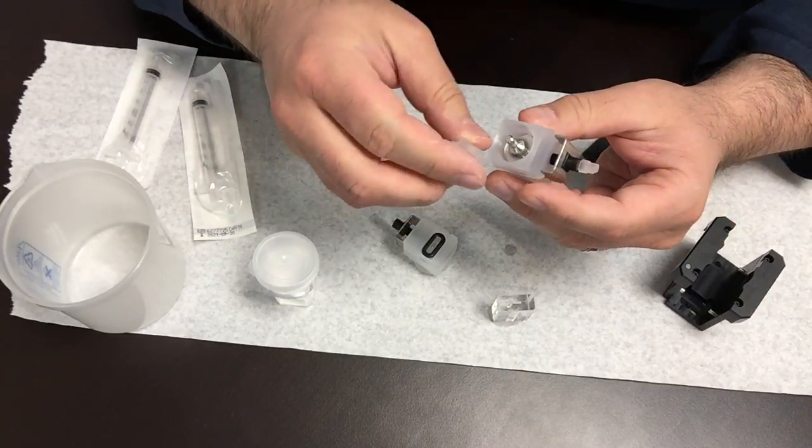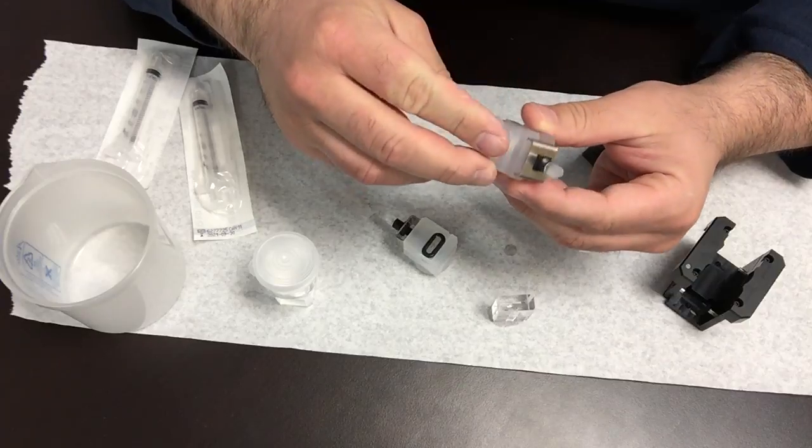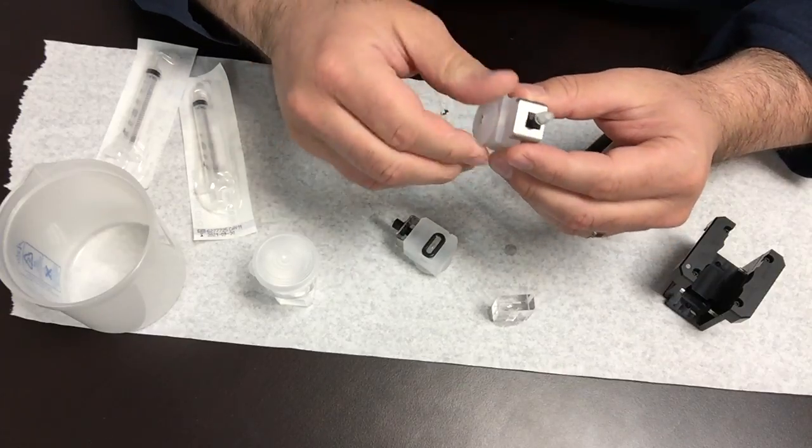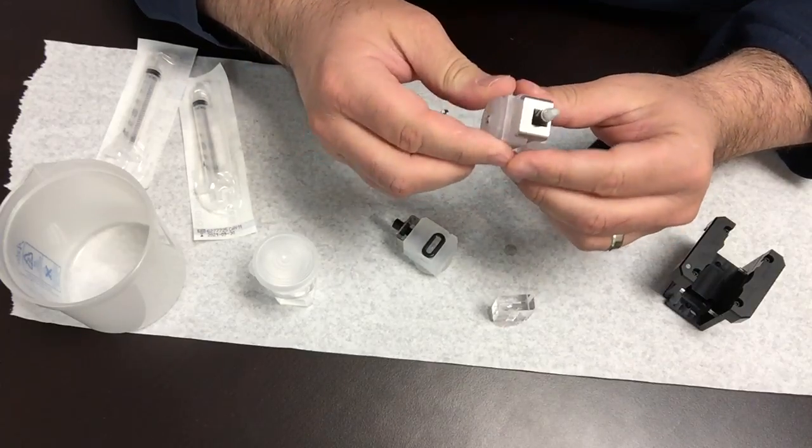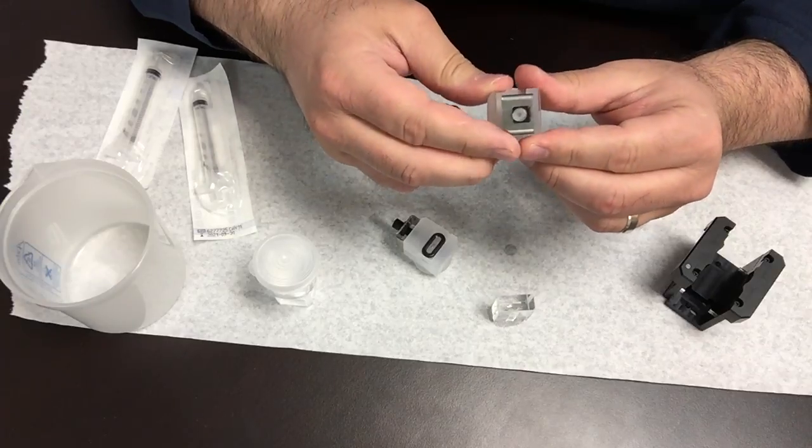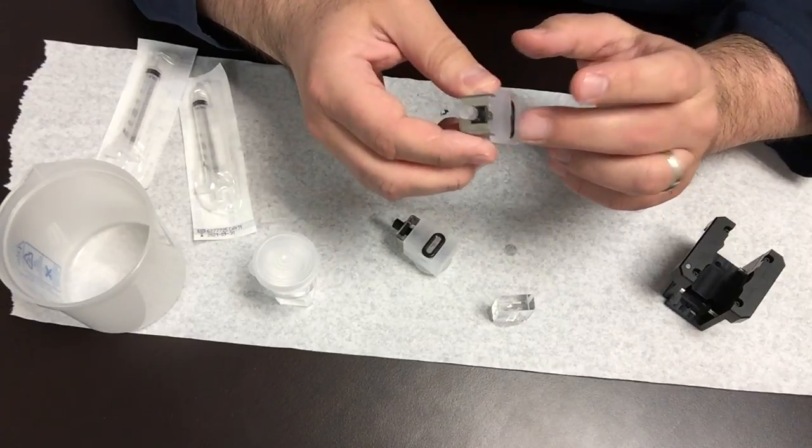The purpose of the curved shaped electrode is to focus the electric field towards the center. That way it reduces the amount of heating when you apply an electric field in a liquid.